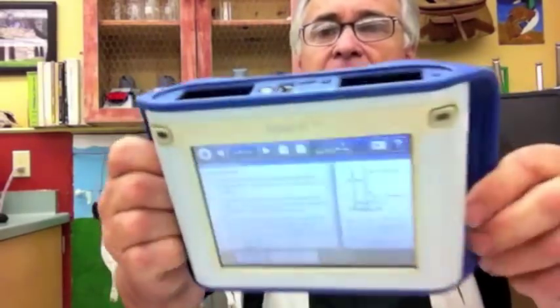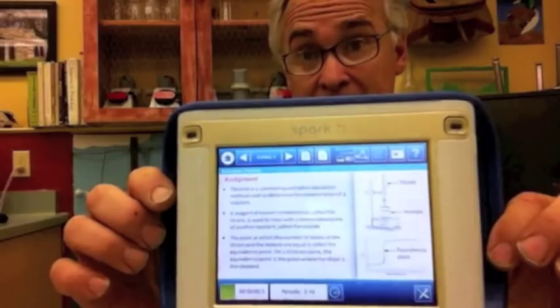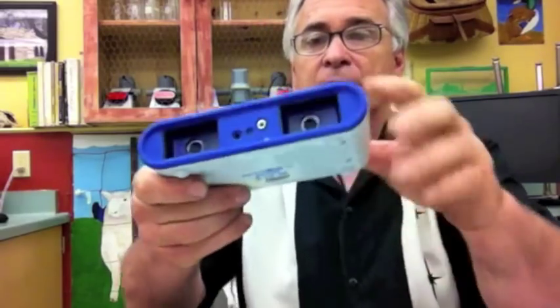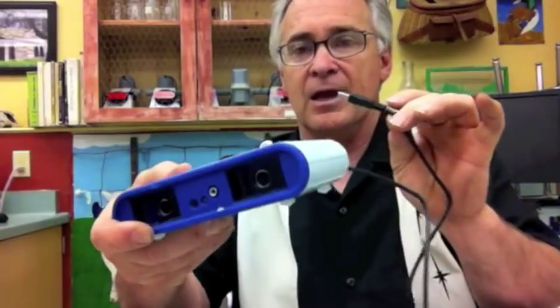First of all, you're going to need some kind of data logger to keep your data in. You can use this portable handheld one, or you can use the one that we hook up to the computers. You hook it up to the USB end and we have all of the labs online for you to read through. The first thing I would suggest is that after you watch this video, go ahead and read the lab very carefully. Look at the pictures there and match up the pictures with the things we have in the lab.